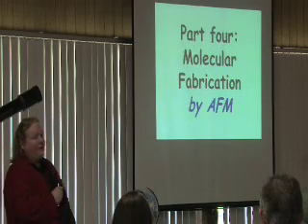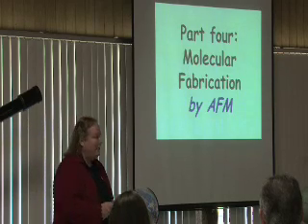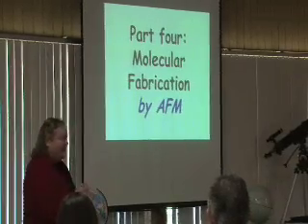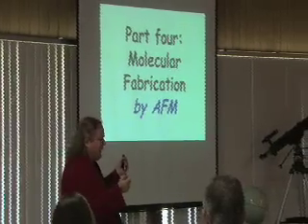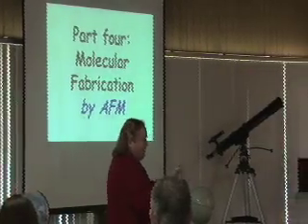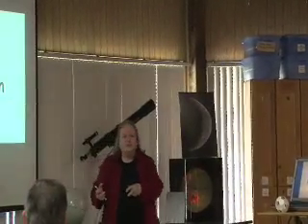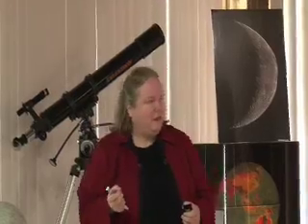Okay, part 4, molecular fabrication by AFM. This is what my lab is known for. This is kind of hard to explain, but we don't have wrenches and tools to put molecules together with our hands. So we do it in solution. And we design the molecules so that they bind to each other. And so we can make really small things in my lab. I'm going to spare you the details. Well, maybe not. I'll tell you a little bit about the details.